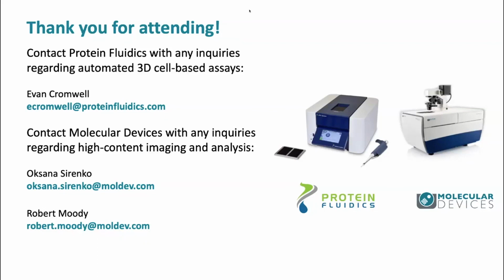No, thank you. I'm a big fan of the NanoShuttle, and actually Lydia's next question was, can we use spheres generated via NanoShuttle? Well, yes, you can. And then how large are the spheres? I think she was guessing 100 to 300 microns, but that really speaks to the 1.2 millimeter diameter of the microwell and how deep you want to image, right? Yes. We've done spheroids and organoids up to 700 or 800 microns, and the islets I showed were typically around 100 microns or so.